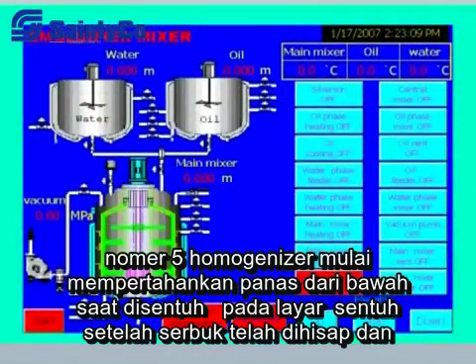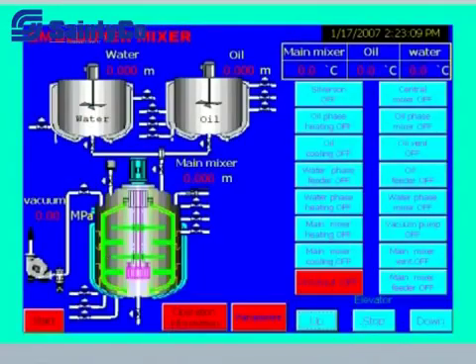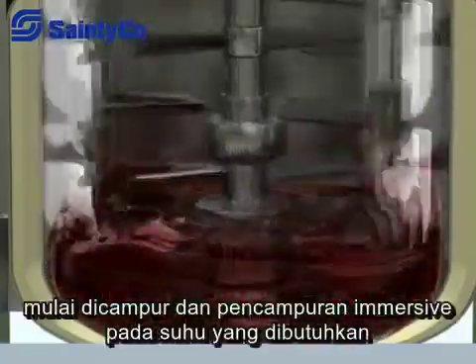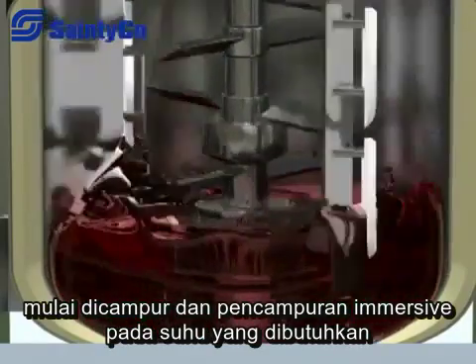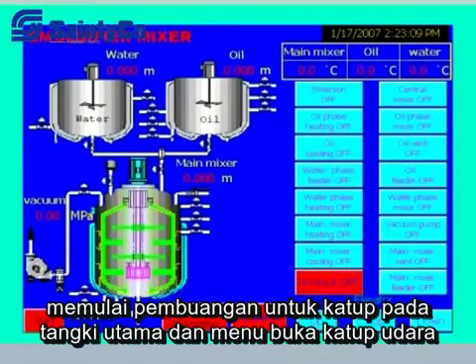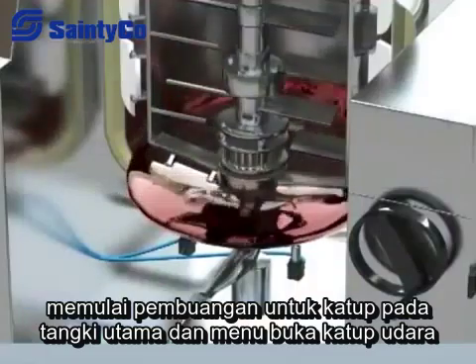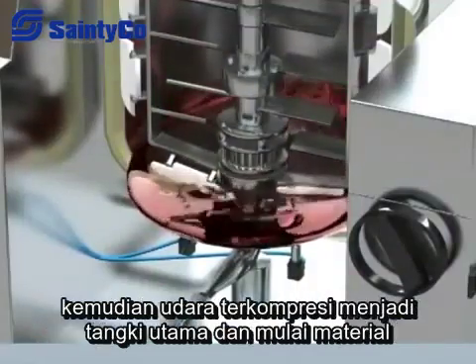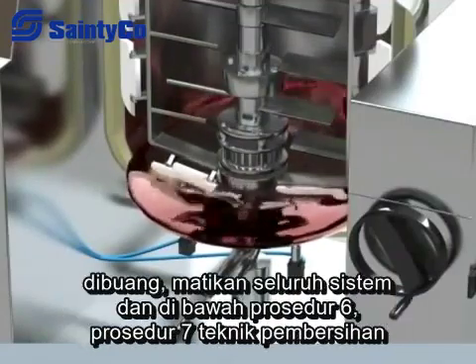For homogenizing, start the main tank heat button on the touch screen after powder has been sucked in, then start emulsifying and mixing after the temperature meets the technical requirements and continue with the next stage. For positive pressure discharge, start the discharge pneumatic valve of the main tank and open the manual air valve so that compressed air enters the main tank and material discharge begins.